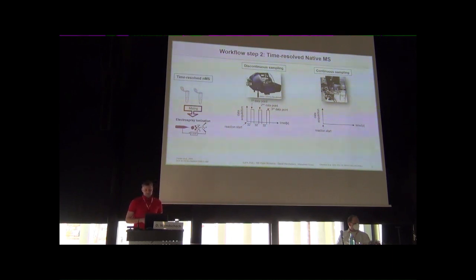In the continuous sampling, this is different. When I mix my sample by pipetting, I need roughly 55 seconds to fill my needle and start the acquisition. And after this, I just run the measurement for about 20 minutes or even longer, depending on your reaction. And then I parse my chromatograms for each data point.